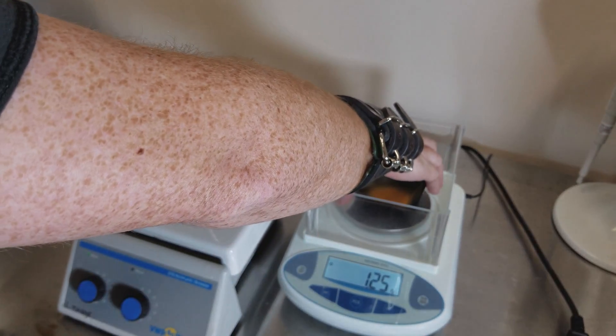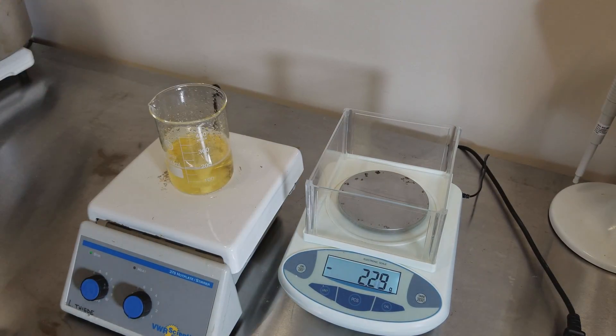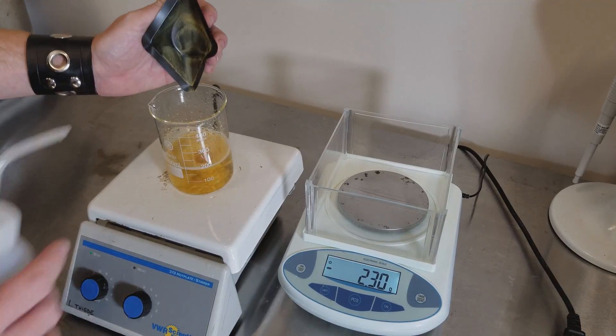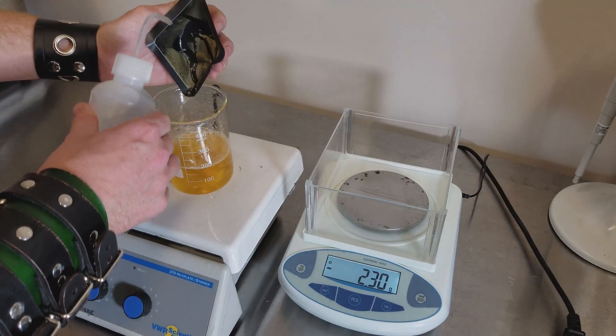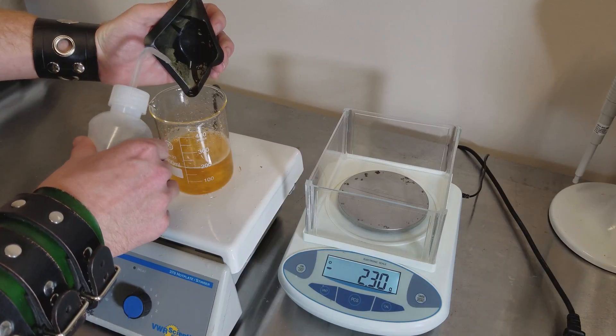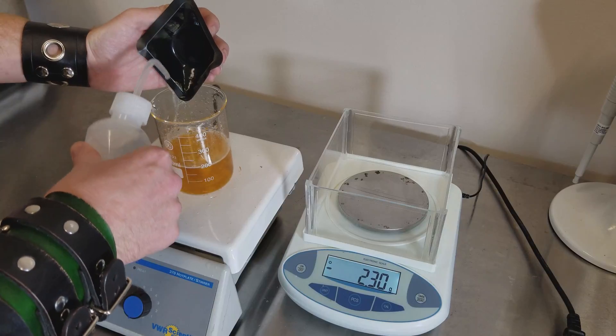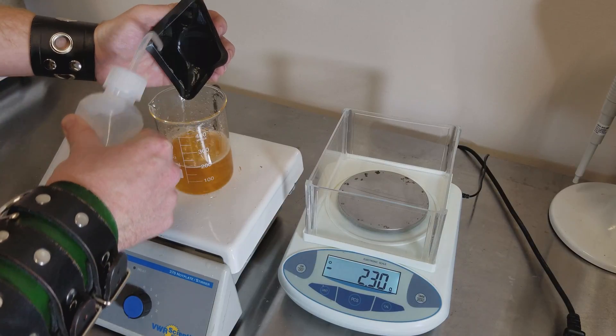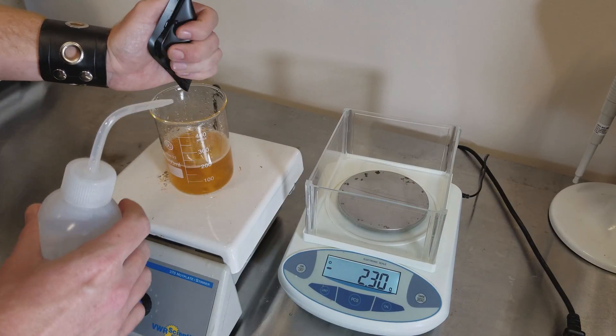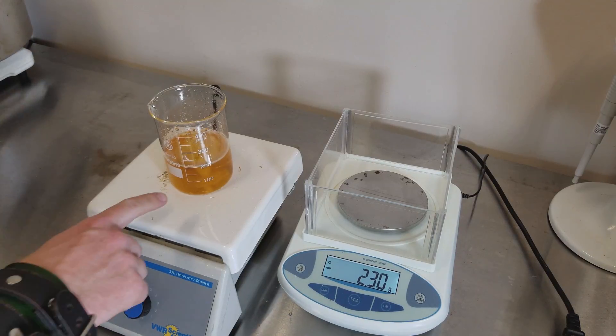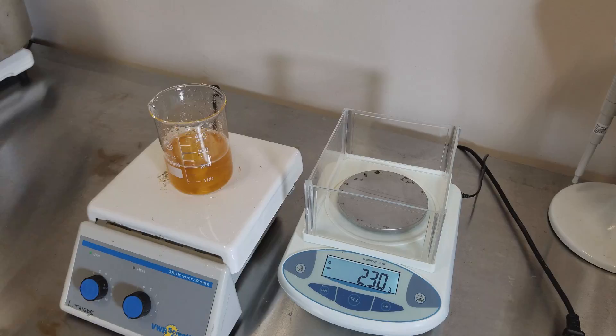Same technique: fold it in half, dump it in, wash down the remaining. Let that mix up. As you can see, we're quickly approaching 200 milliliters. We don't want to go over 250.